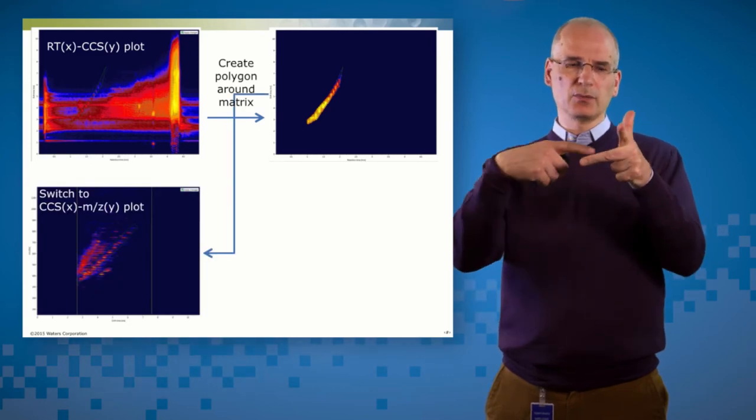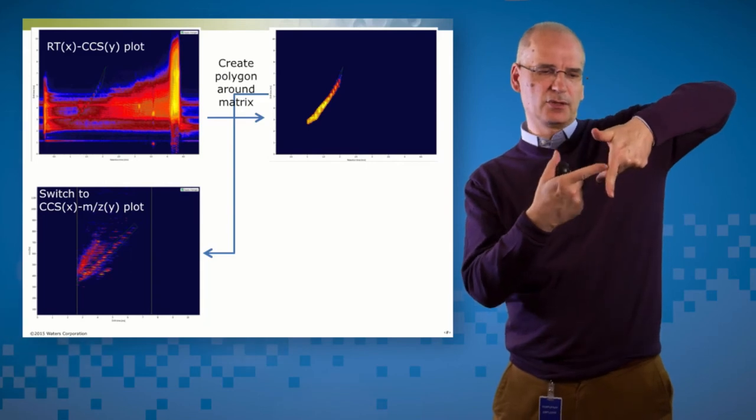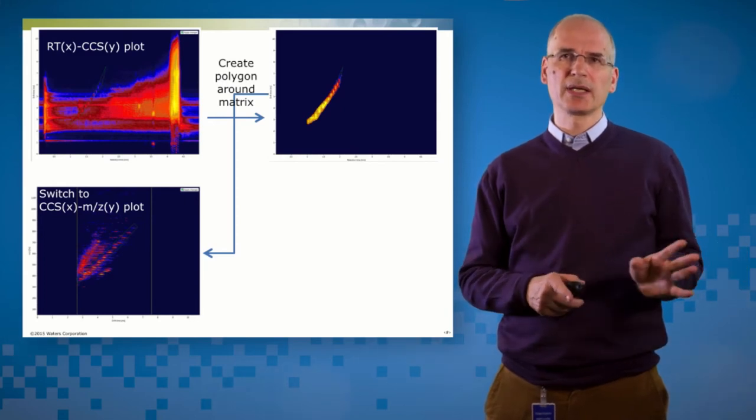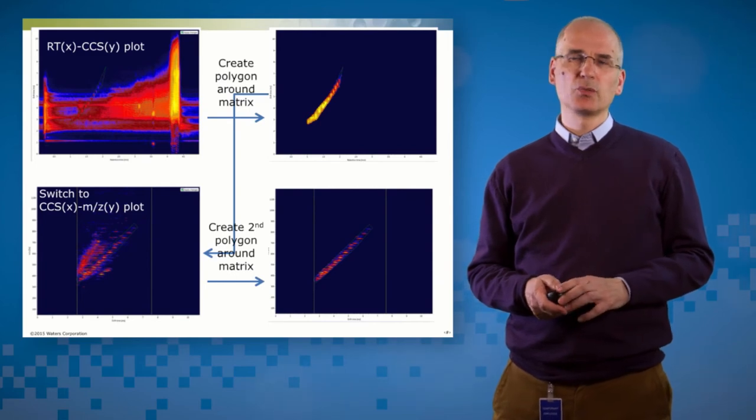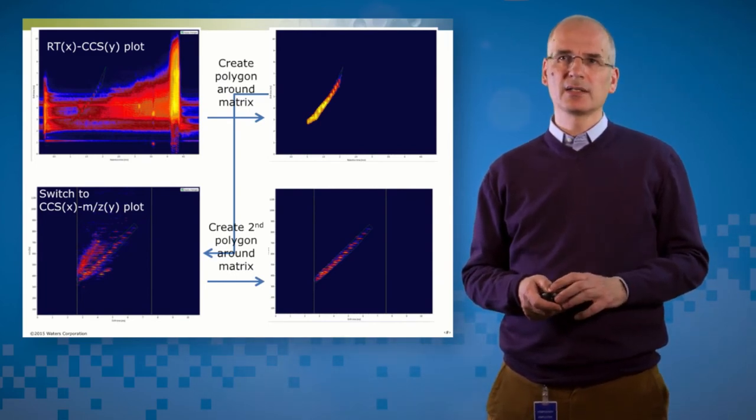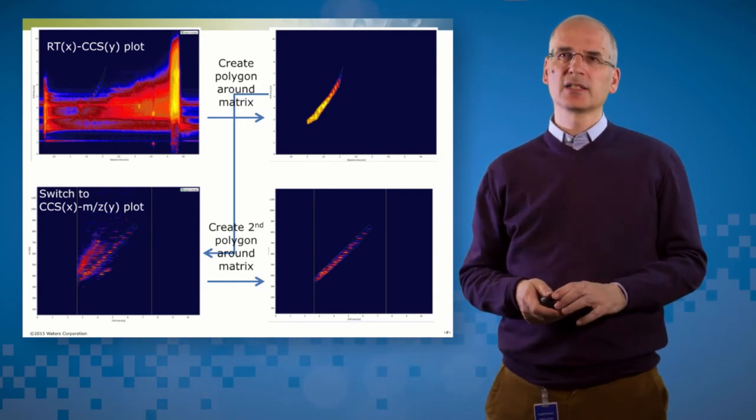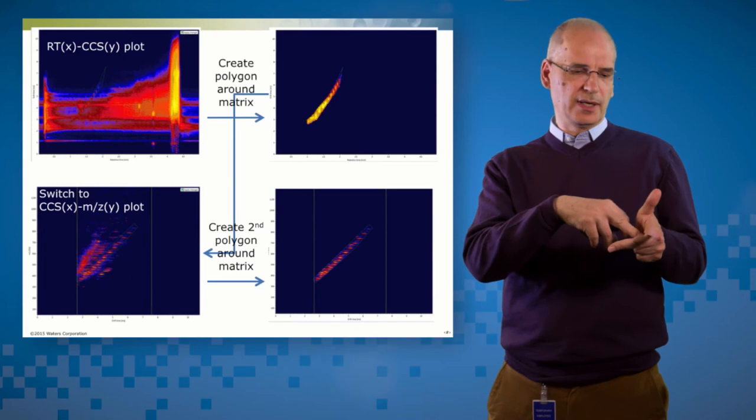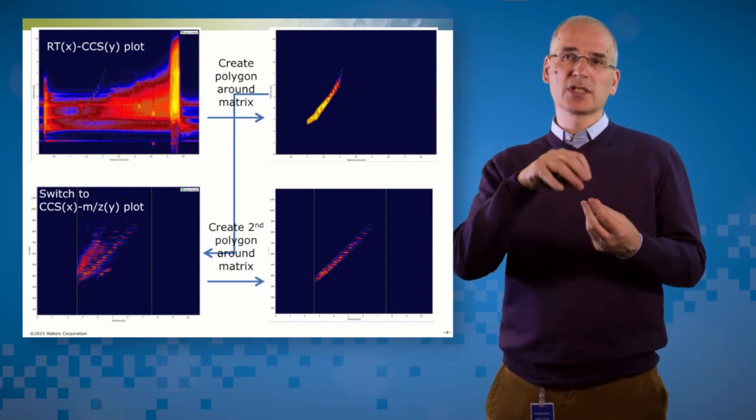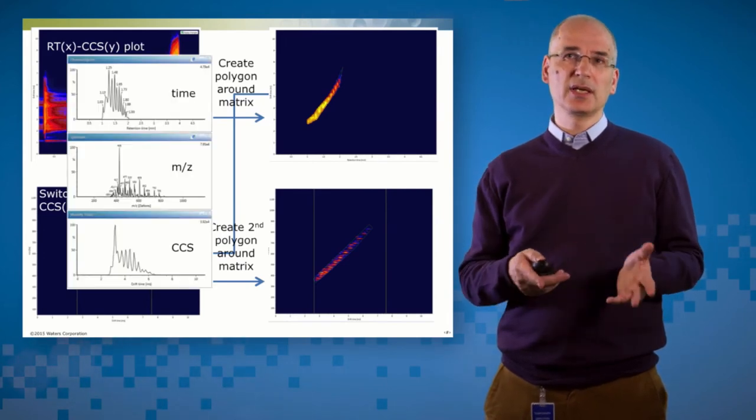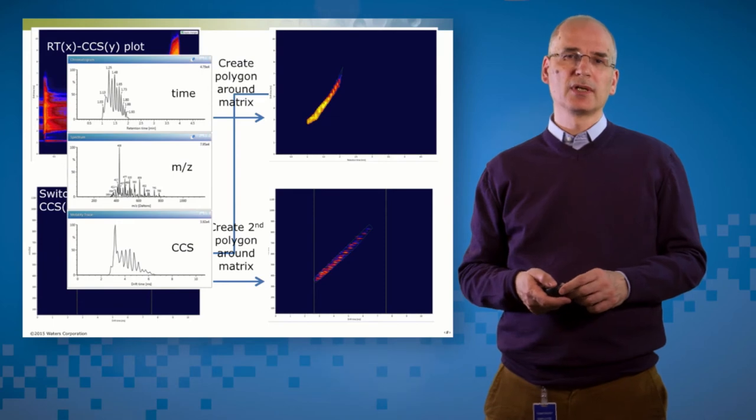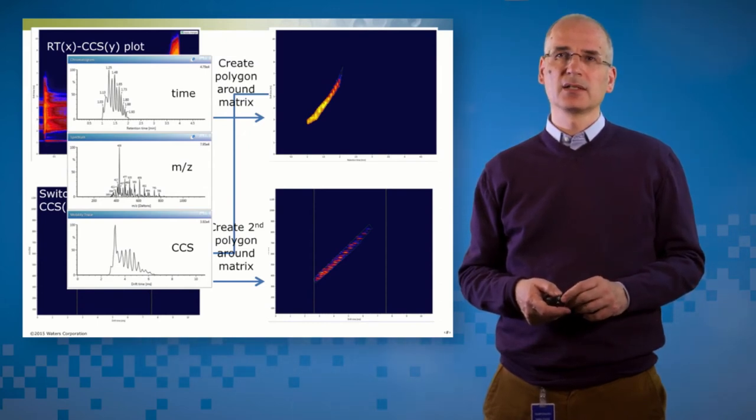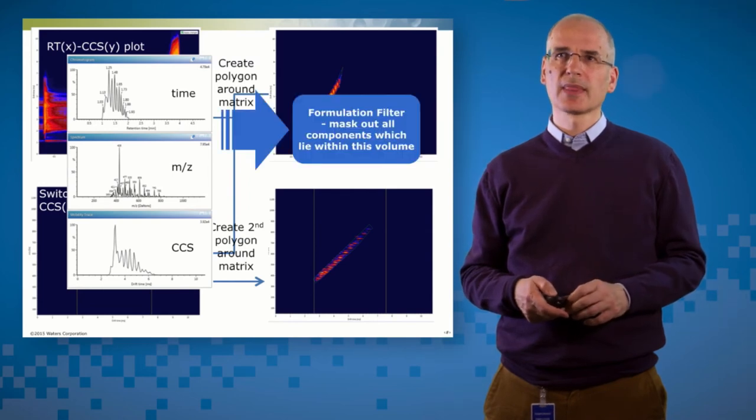And then I can change dimensions. I've switched now for those same selected components into drift time mass to charge space. So now I can create another polygon around where I know that the singly charged PEG ions elute in that orthogonal view and create a second polygon around that. So what I've effectively done is created a three-dimensional volume inside my retention time CCS mass to charge space, which is specific for polyethylene glycol. And if I look at that now, you can see here's the chromatogram in the top of all the PEG components and the spectrum of all the PEG components. And on the bottom, the driftogram, the CCS display of the various components in there too.